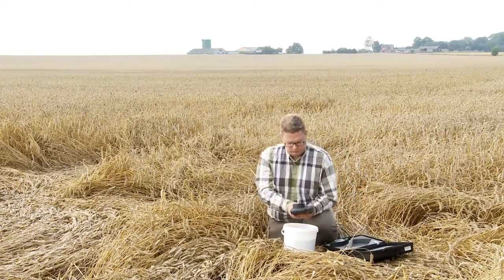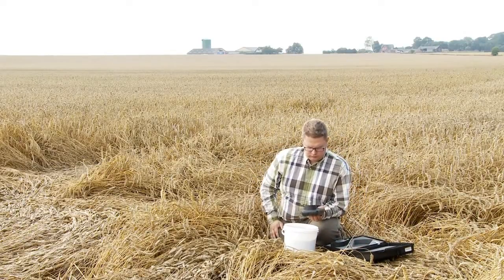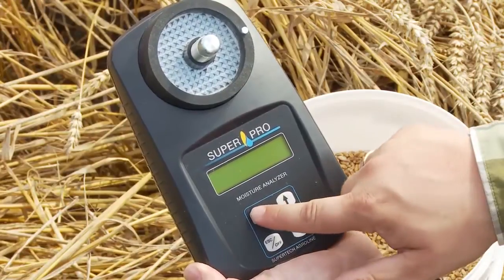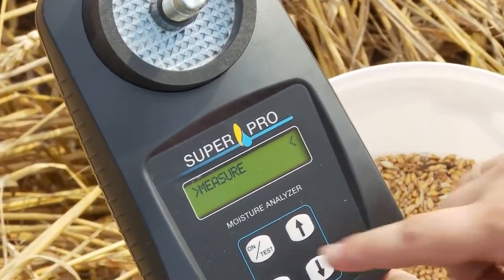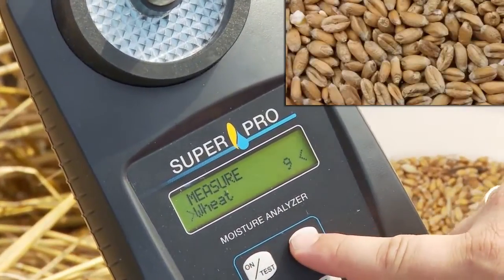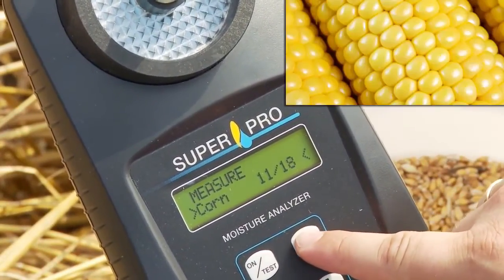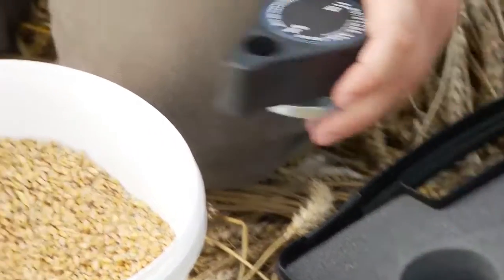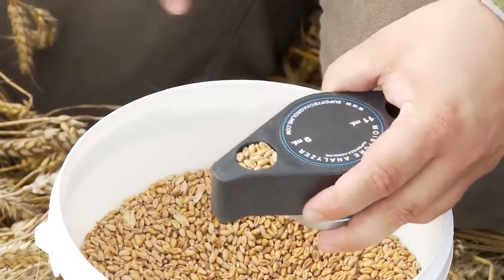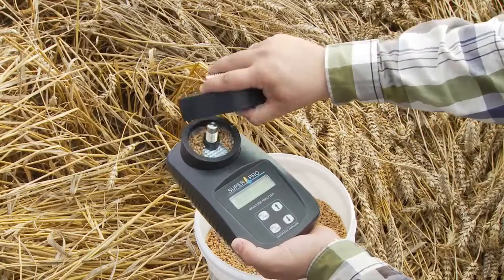SuperPro Moisture Analyzer is easy to operate. First you switch the SuperPro on. Then you choose the right crop using the arrow keys. SuperPro has up to 20 crops pre-programmed, depending on the crops grown in your area. The built-in measuring cup in the grinder handle makes it quick and easy to measure out the volume for testing.